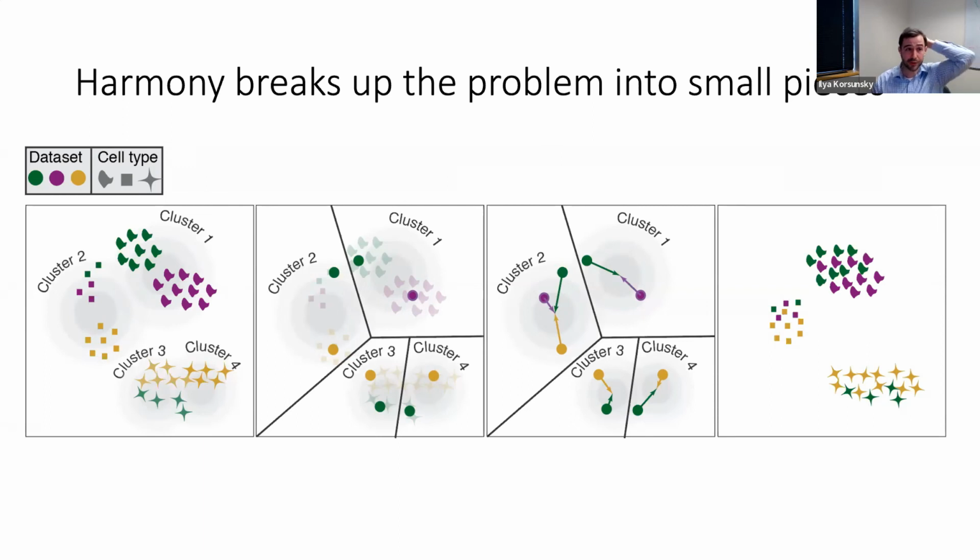When you multiplex donors into the same 10x lane, you drastically reduce batch effect between the donors, right? And so a lot of times we just don't actually correct for donors if they're all multiplexed into the same 10x lane. Sometimes we leave them as is. Sometimes we integrate them anyway.